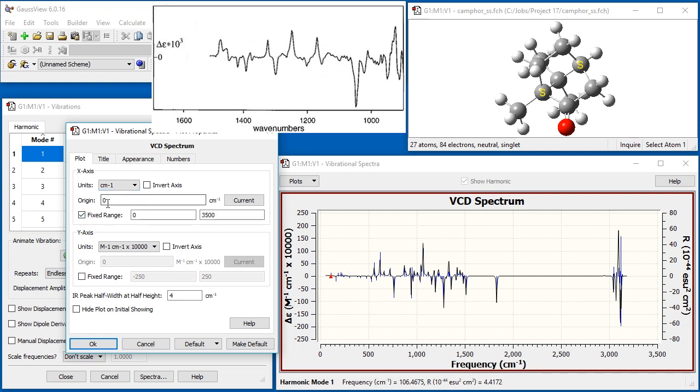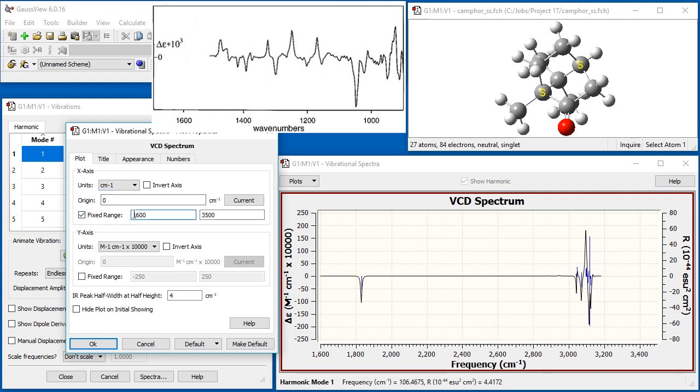Open the Plot Properties dialog and match the x-axis range to that of the spectrometer. Also, reverse the ordering of the x-axis using the Invert Axis checkbox.